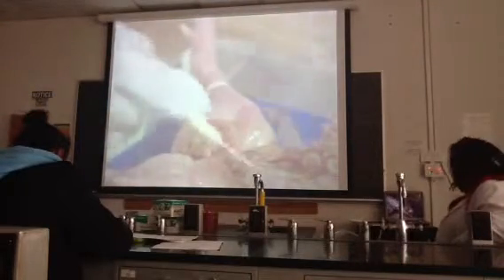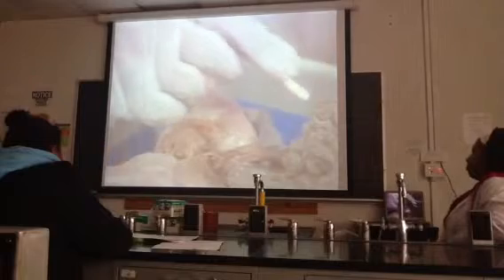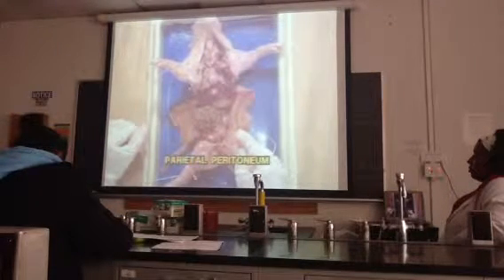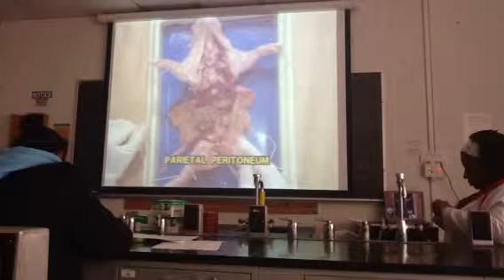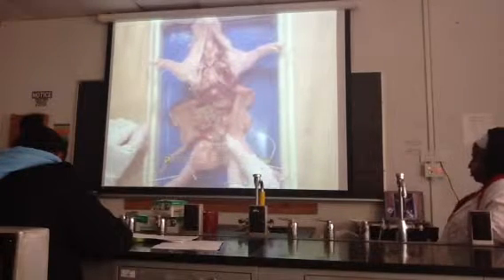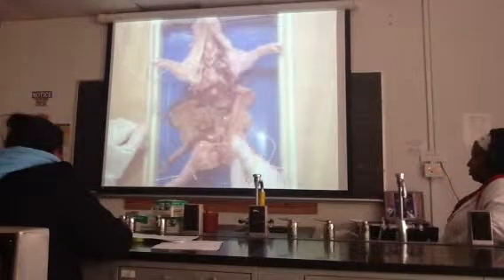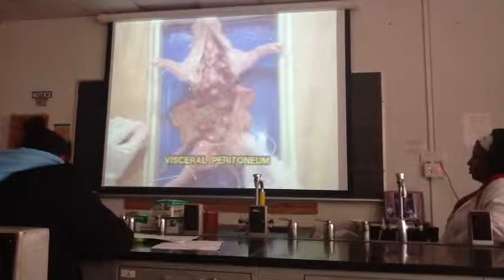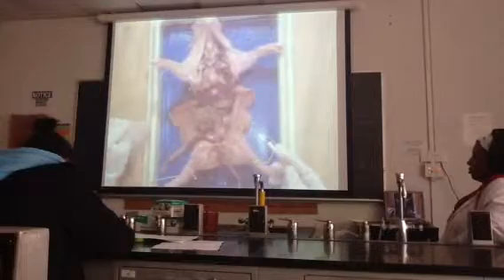The shiny material which lines the body cavity is called the parietal peritoneum. The other type of peritoneum in the body covers the organs. This type is referred to as the visceral peritoneum. In our next section, we will study the mouth cavity.